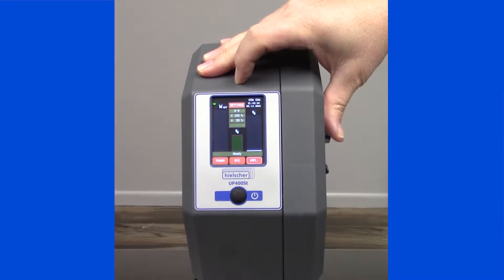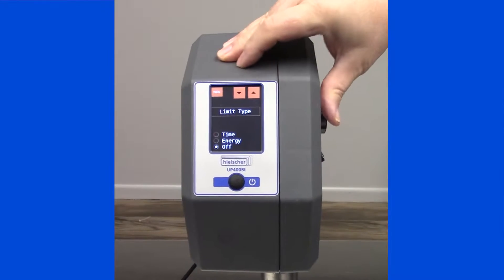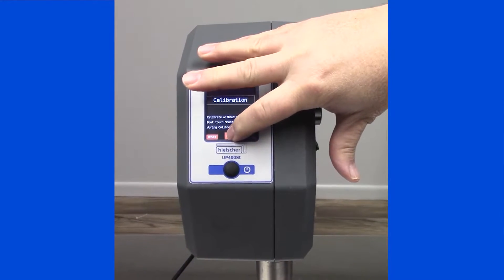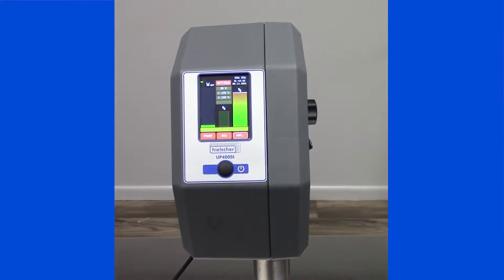The first thing we'll do is we're going to calibrate the unit. After the sonotrode is installed, I'm going to set settings, hit the down arrow, and this calibration, I hit start. The unit will self-calibrate.